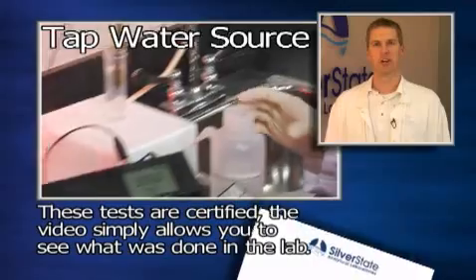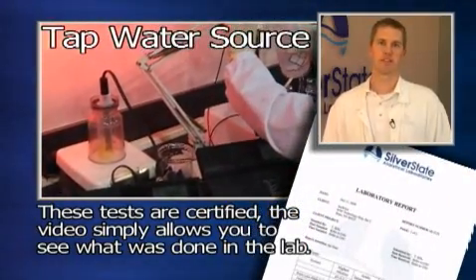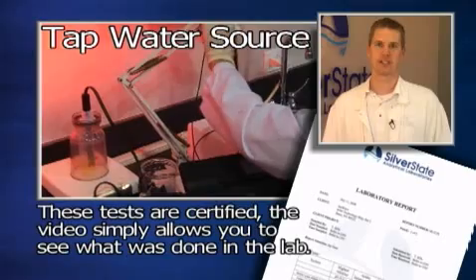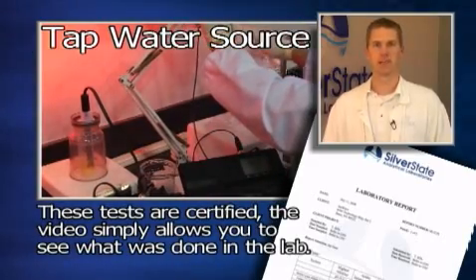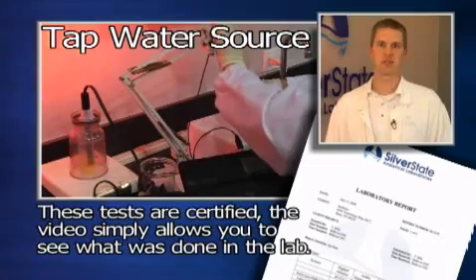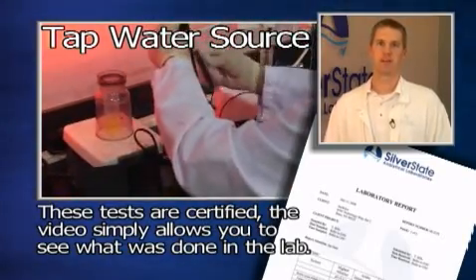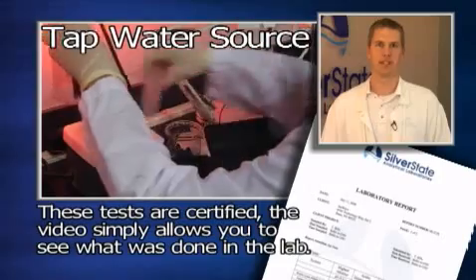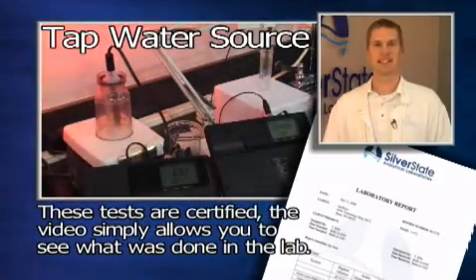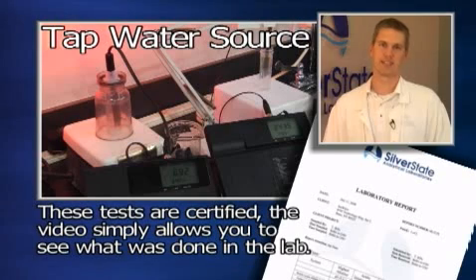It's very important to note the precise process being followed during testing. Each water sample is put into an unused clean sample container and then discarded after each sample was tested. The testing probes are cleaned between each test with deionized water to avoid contamination of the water samples. Please note that our precision laboratory grade testing equipment is so sensitive that it could take several minutes and often much longer to get final test results with each water sample.